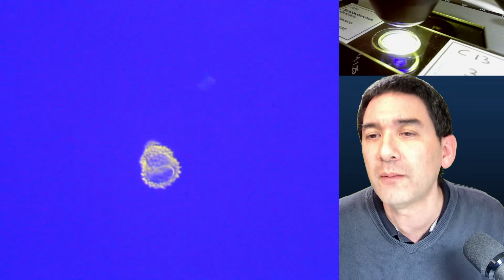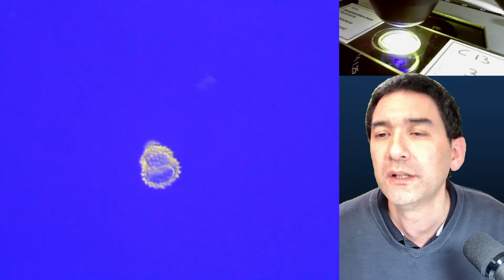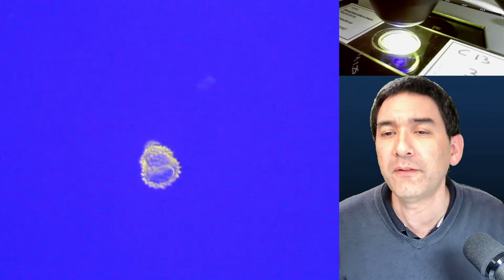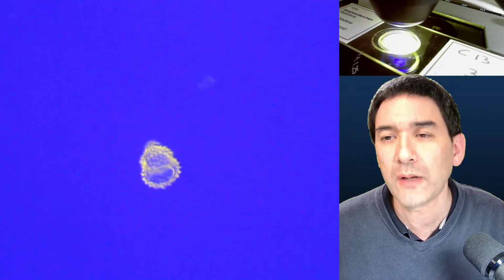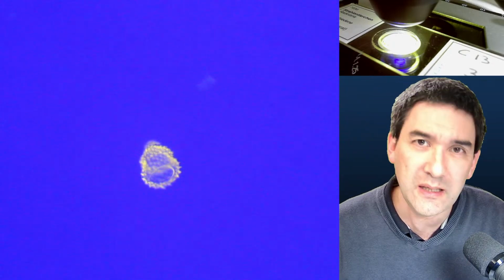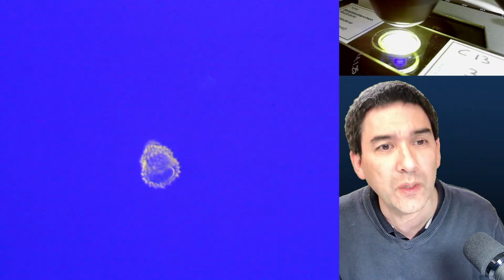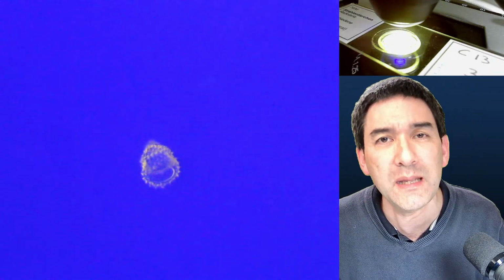Yeah, so I see again a whole bunch of comments here. Can I do that if I don't have a filter holder? What you can try to do is, well, you do need a condenser. What you can try to do, and maybe I'm going to try that as well, is place it directly over the lamp and move it up. Okay, so let me try this. I've never tried this before.